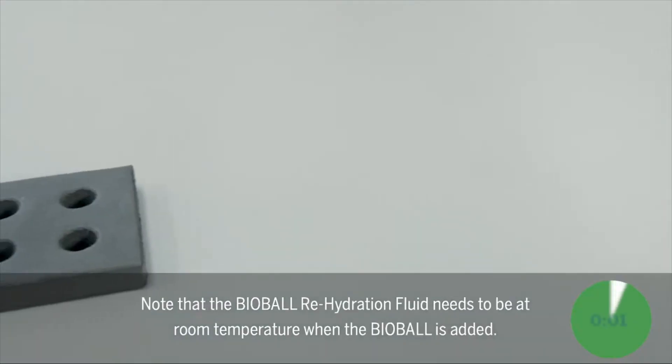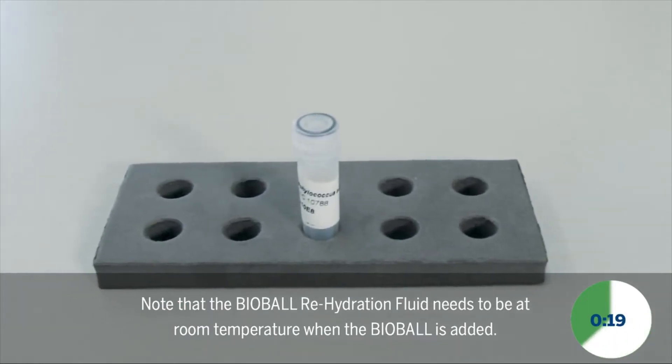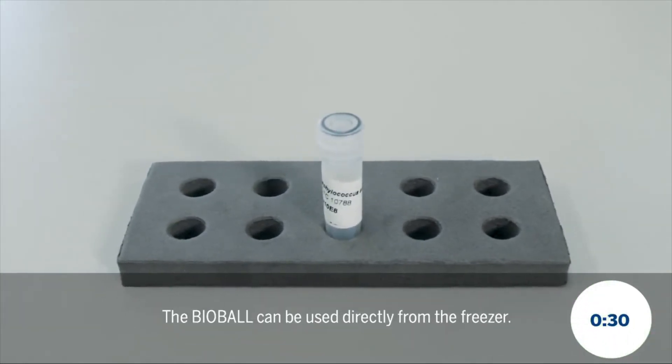Note that the Bioball Rehydration Fluid needs to be at room temperature when the Bioball is added. The Bioball can be used directly from the freezer.